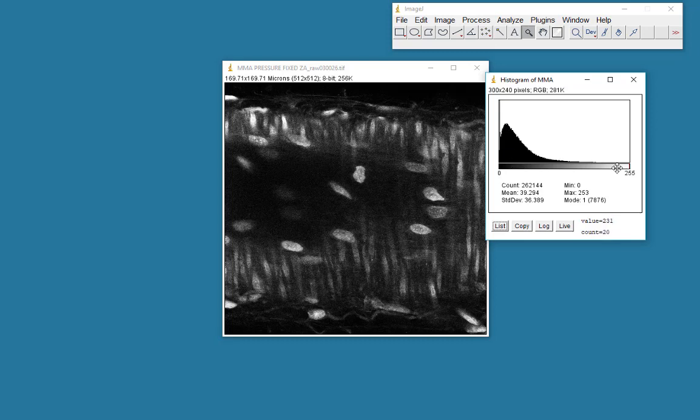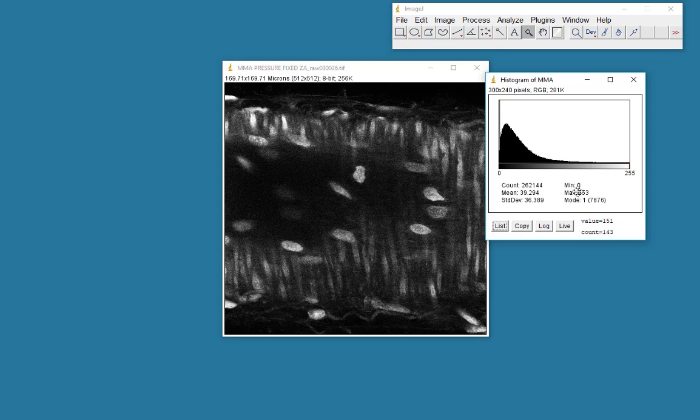There are very few pixels, if any, which are actually 255. And in fact, if we look here, we'll see the minimum value in this entire data set is 0. The maximum value is 253. So there are no values that are 255. We'll have no saturation.